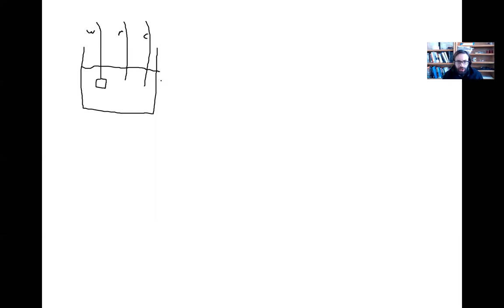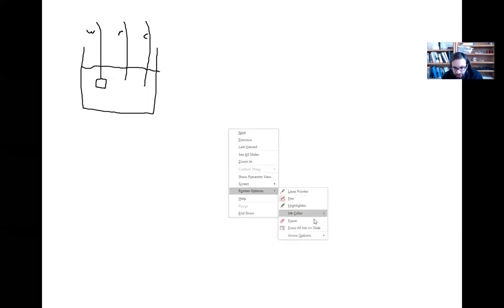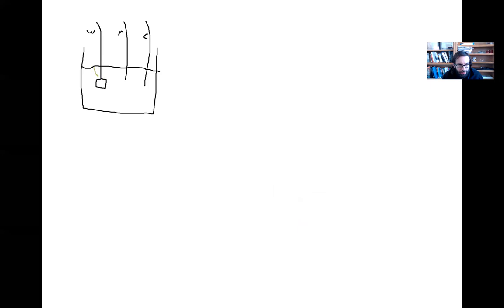Okay, so what does that mean? That means that we're losing electrons, right? So oxidation means we're losing electrons. So coming away from the working electrode, we're going to have electrons. So there's kind of a buildup of positive charge here. Now, those electrons have to go somewhere, okay? Well, they're going to go through the potentiostat. And remember what the potentiostat is doing is it's controlling the voltage between the reference and the working. So that's what it's doing.